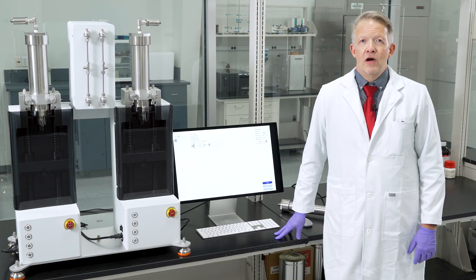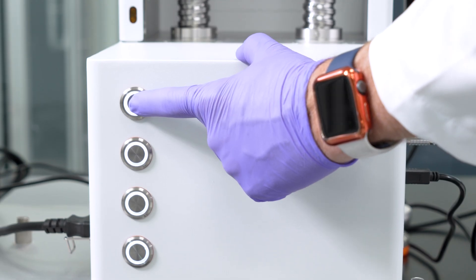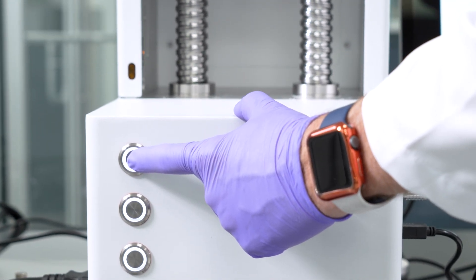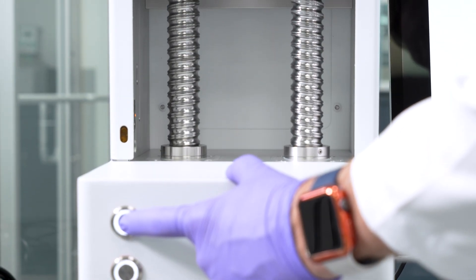This is the Chemex HP6 Ultra High Pressure Syringe Pump, a new patented system for core flooding in oil and gas, advanced material research, and pharmaceutical application.